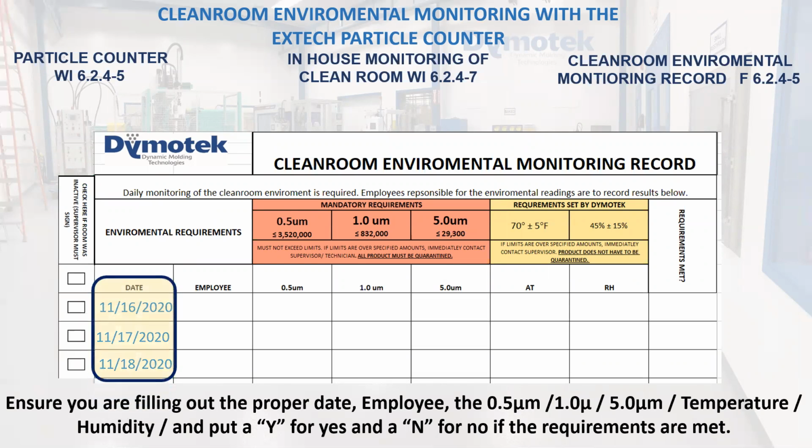The log will already have the dates pre-typed in. Ensure you are filling out the proper date. Write your name. Fill out the data from the record from the VPC 300. Compare these numbers to the maximum allowed numbers in the boxes above, and write a Y for yes and N for no if the requirements were met.